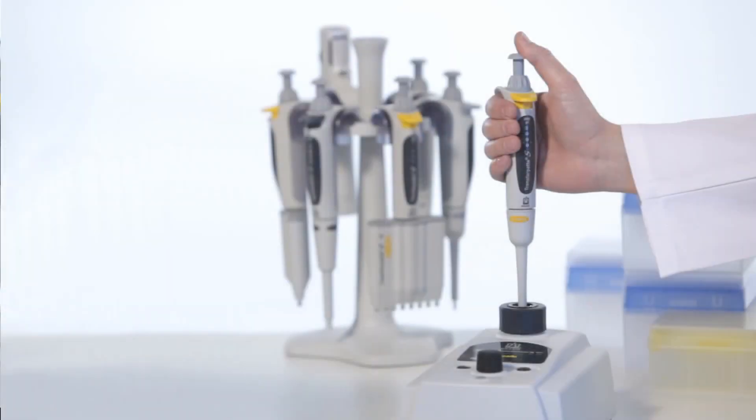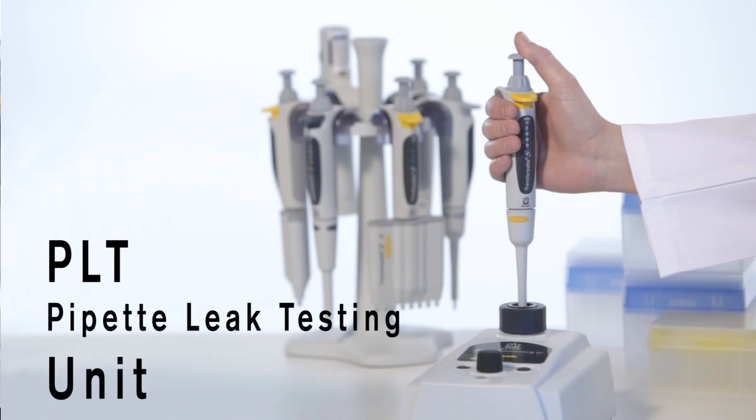Through fast and easy daily checks, you safeguard the intervals between mandatory gravimetric testing. With the PLT unit from Brandt, you decisively improve the process reliability of your pipetting systems.